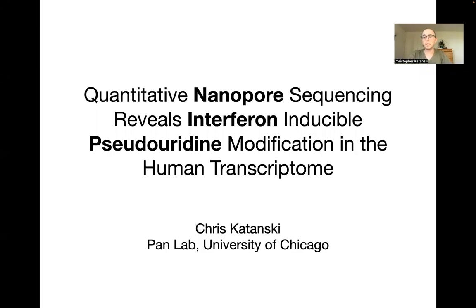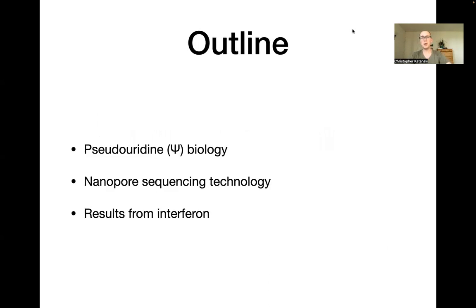I'm a postdoc in the Pan Lab, and today I'm going to tell you about some of our work with pseudouridine and in the immune regulation. So to start, I'm going to talk to you about pseudouridine biology. Then I'm going to review nanopore sequencing technology, and then finally dive into some of our results related to interferon treatment.